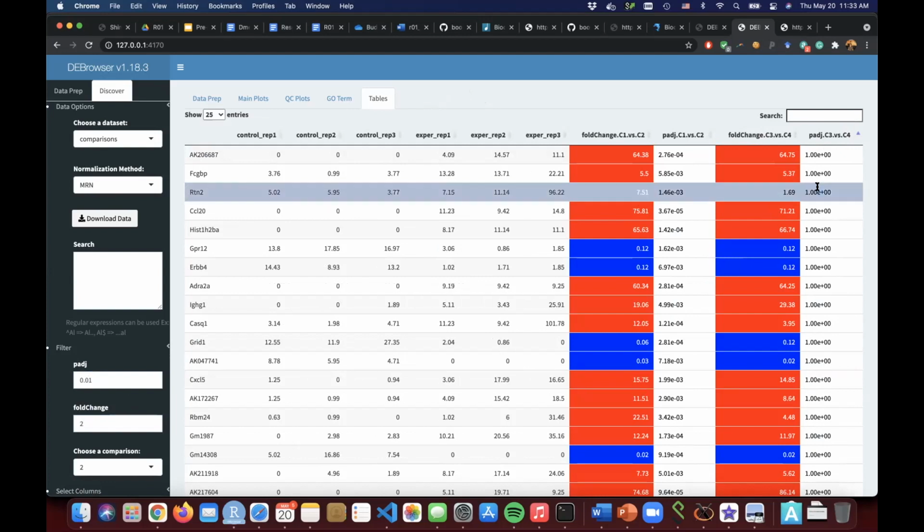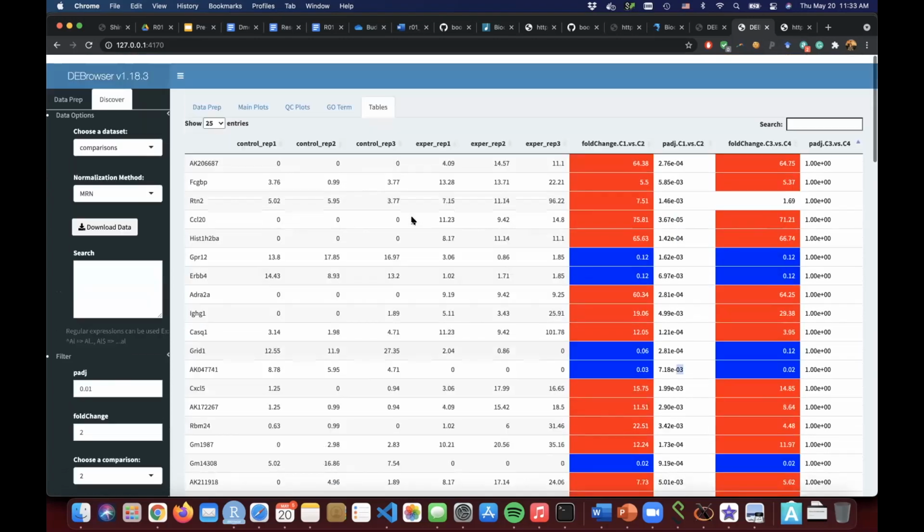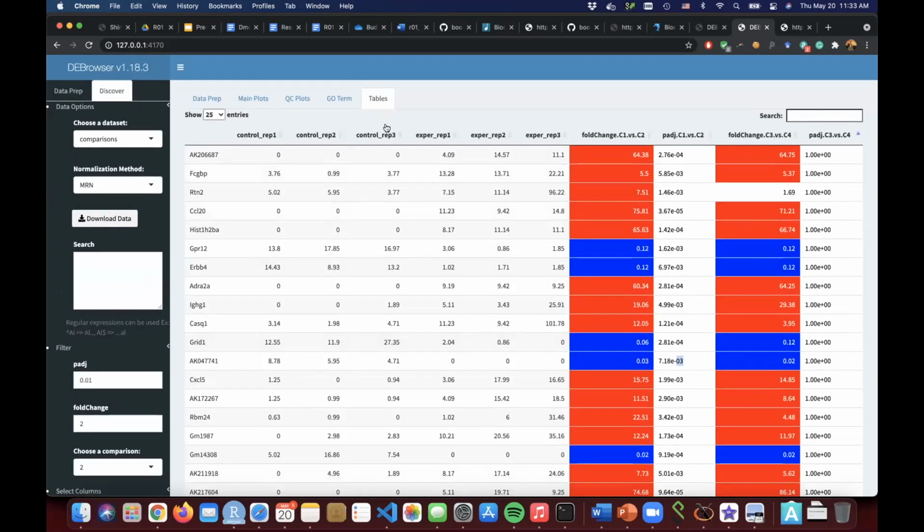When you have 2 replicas, it is not. So you can see it. And there are many things here, like these are not significant. Here they are significant. See, these numbers are low, but still it's 0 in one, not in the other one. So these kinds of things are very helpful.